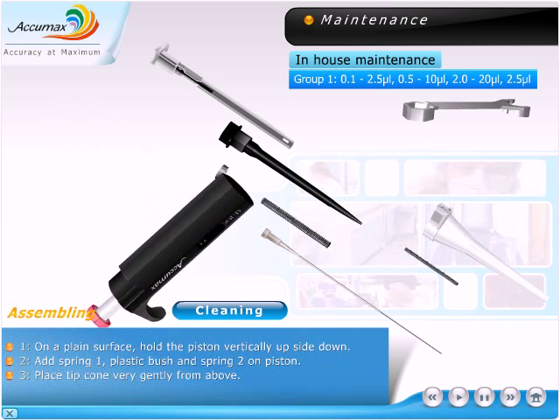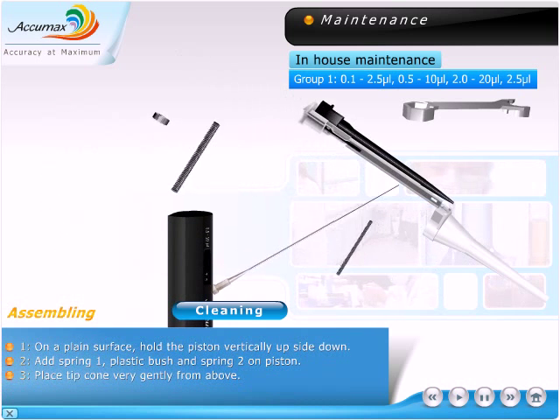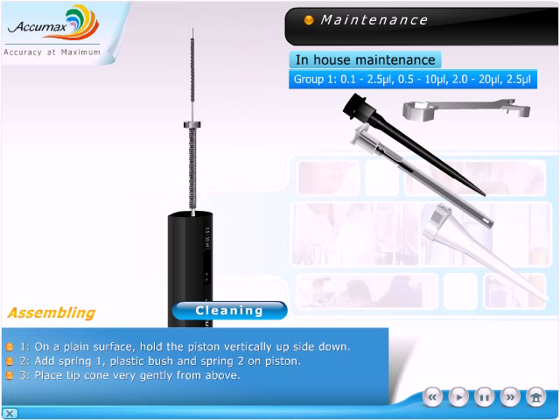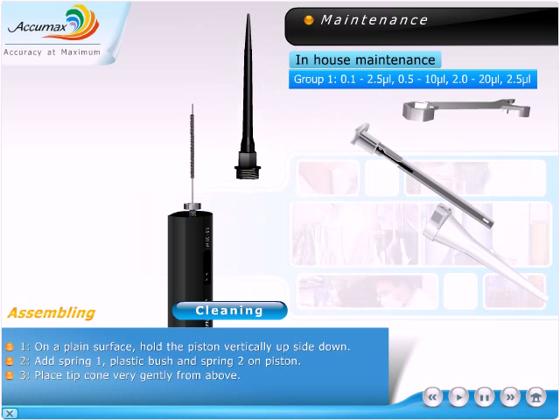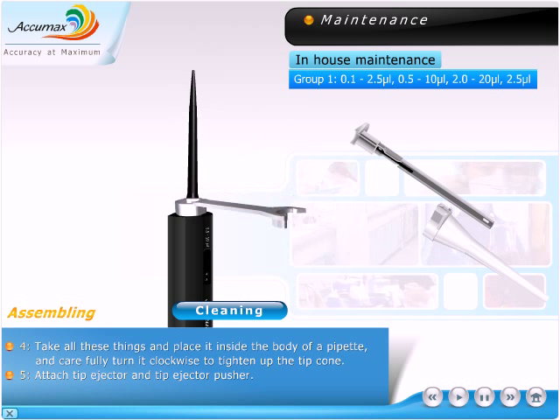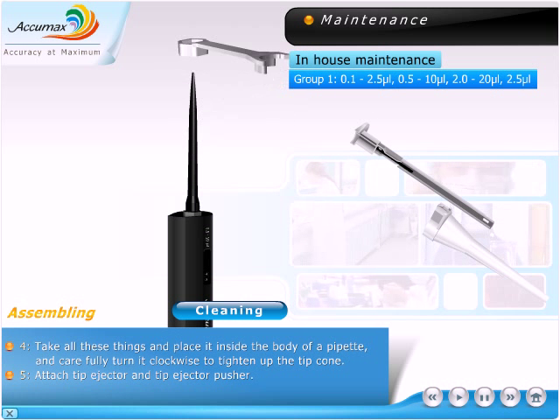Assembling. On a plain surface, hold the piston vertically upside down. Add spring 1, plastic bush, and spring 2 on the piston. Place the tip cone very gently from above. Take all these parts and place them inside the body of the pipette, and carefully turn it clockwise to tighten up the tip cone.